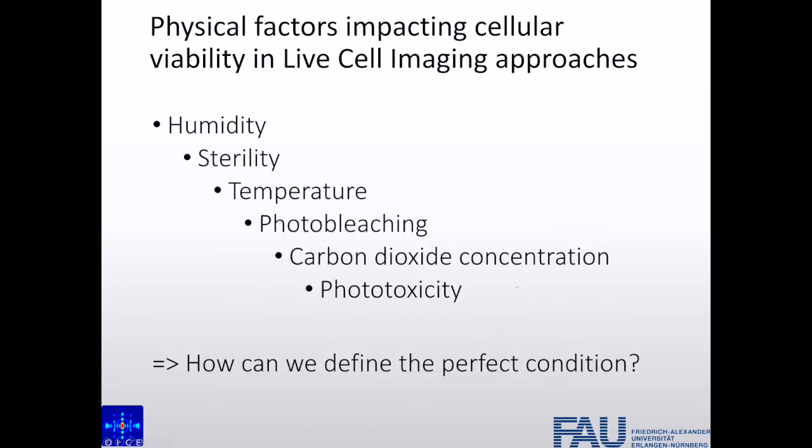How can we define the perfect condition? This is also not really simple to do. Probably you have to define it according to your result. If the carbon dioxide concentration is important for your research, you have to focus on that. Or if phototoxicity is an issue, you have to focus on that. But how can you define the perfect condition? This is really elusive at the moment. As I say, the most important thing is that you have the same condition for your control as you have for your sample. And already this is not easy.